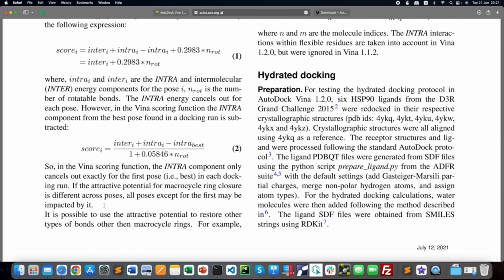So basically there are different types of modes in AutoDock Vina. You can vary until 100. There is no optimum number of poses or interaction range. So basically we generally give n is equal to number of modes is equal to 20. 9 is default, I guess. Yes, 9 is default. But you can increase it until 100, 200, 300, depending on your needs. So in this particular tutorial, we are going to use n is equal to 20, which is good enough.